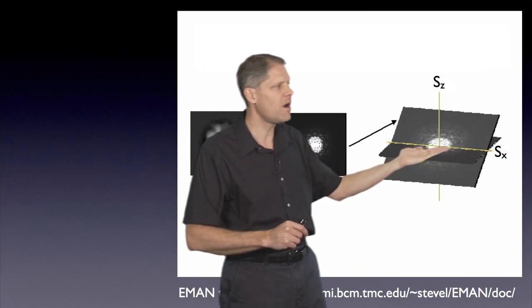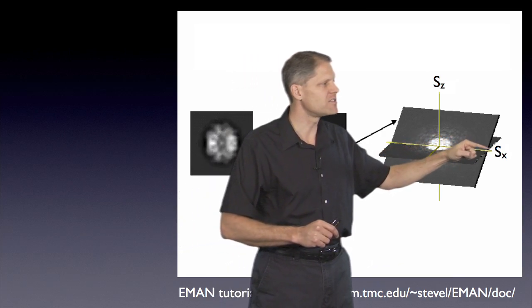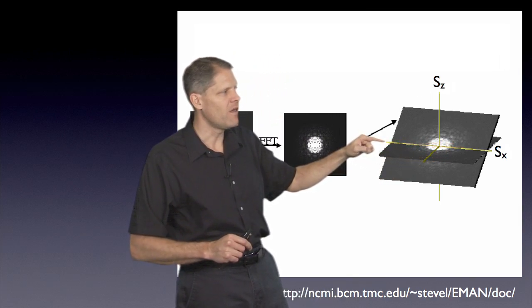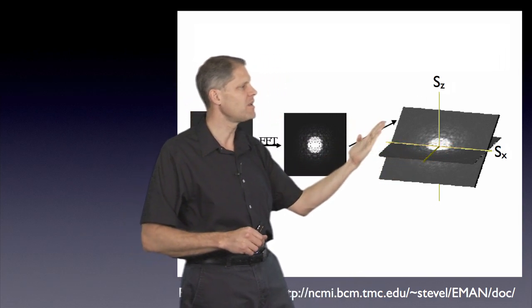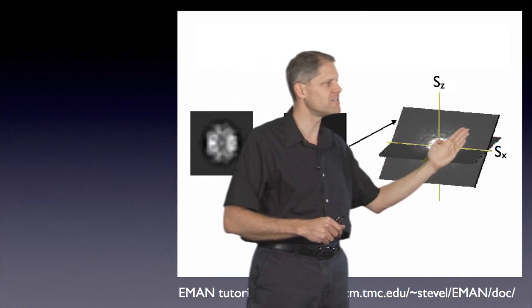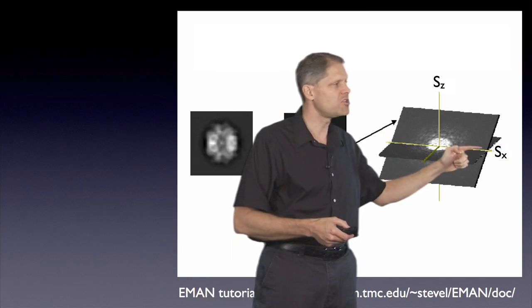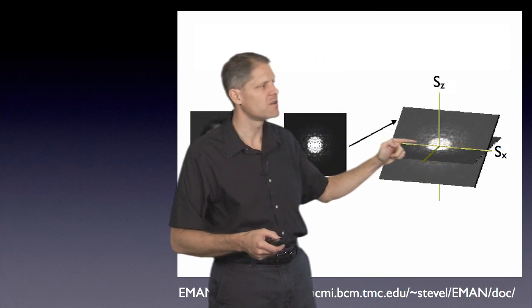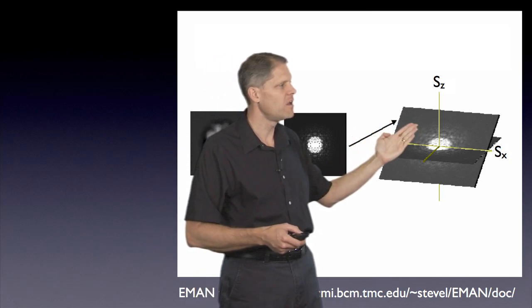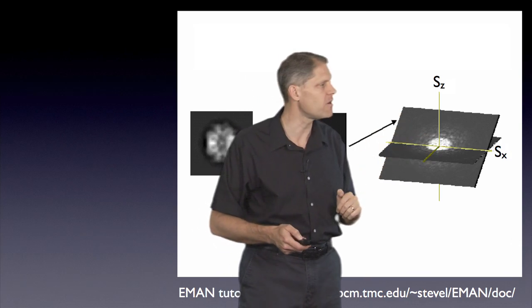And so if we can computationally detect this line, it's called the common line, where the amplitudes and phases are the same, then we can orient how to put in the Fourier transform of our second image, how we can place that in space, where it belongs in that reciprocal space. We know where it should intersect with the first transform, but what we don't know yet is the angle of how much they should be tilted with respect to each other. We still don't know that angle.